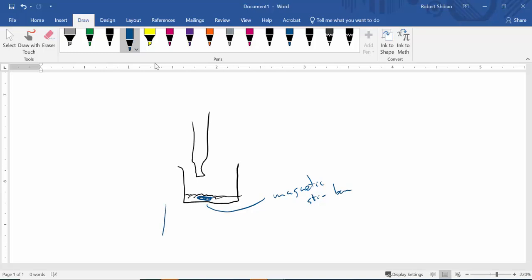And then we're going to place this on the stirrer. But the trick is, I told you to dissolve it in a minimum of water, but we have to submerge the probe completely. And so the glass bulb here must be completely submerged. So let's say you're very good and you dissolved it in a minimum, but you didn't submerge the probe. Unfortunately, we have to add more water. You have to add more water until the bulb is completely submerged. And then usually what I do is I just clamp the pH probe here.